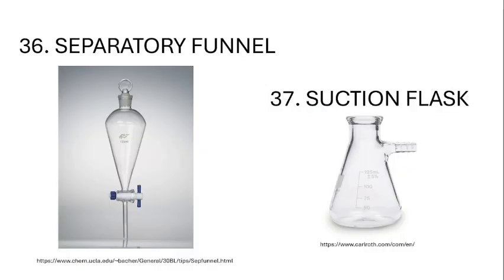The next apparatus would be your separatory funnel. It looks like a pear. And then you have here a stopcock, a valve, and at the top you also have its cap. In the lab, the cap is plastic or PTFE, same material as this one. Then this tip or edge is similar to that of the edge or the end of the funnel.